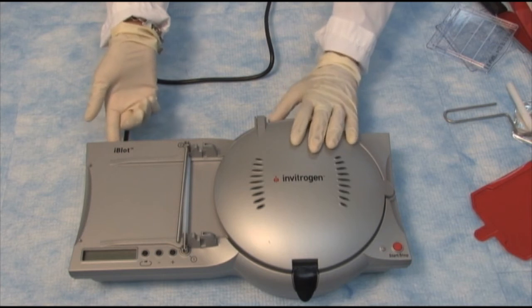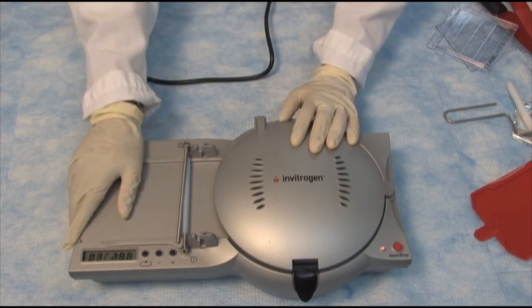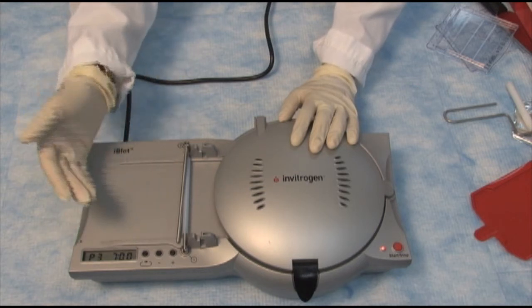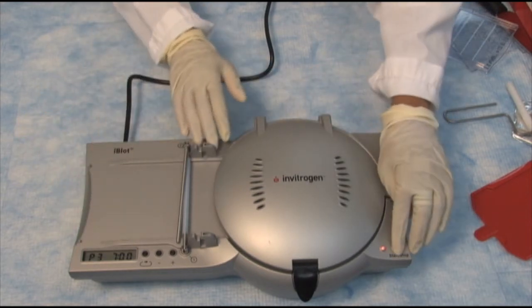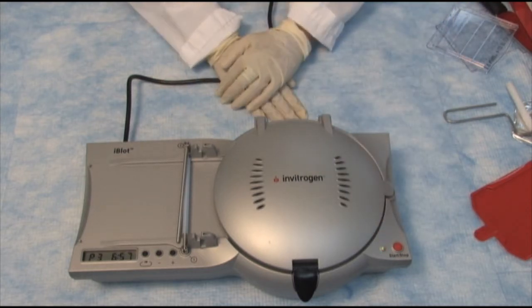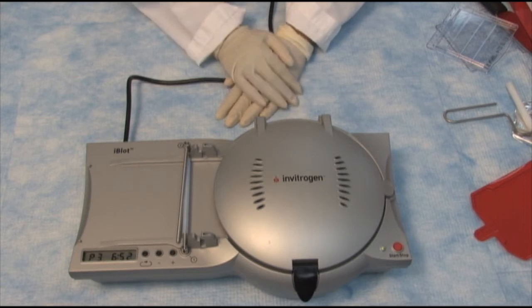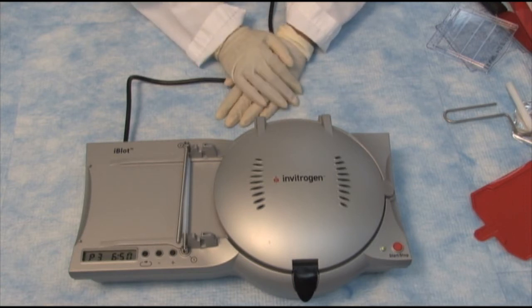There's a flip switch at the back that turns on the device, and you simply use the preset program in the instrument to run. Just press start, the red light turns green, and you're set. In seven minutes the device will beep indicating that the transfer is done.